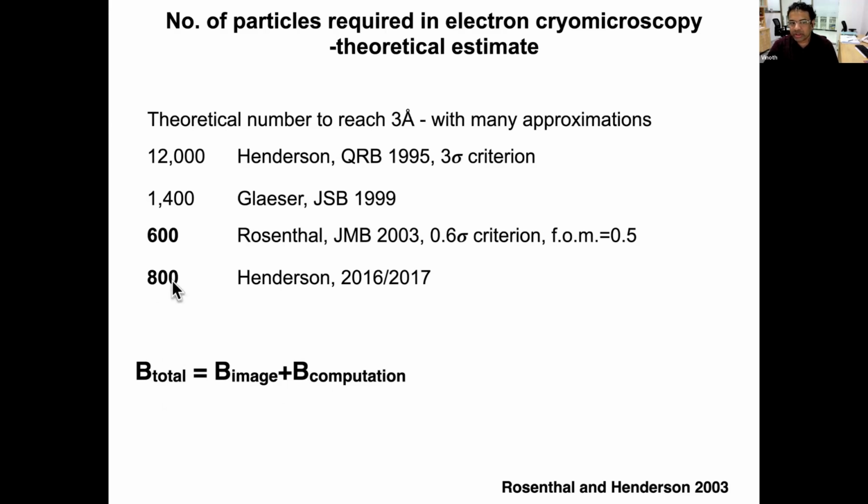If you look at some of the articles that are published, you will find that there's a big workflow where they start with possibly millions of particles and maybe hundreds or 10,000s of images, and eventually when you end up with a map, the final map may have only 1/10 or 1/20th of the initial particles that were started. That's mainly because of the B factor coming from these two. So this is one important criterion that needs to be remembered when we set up for data collection.